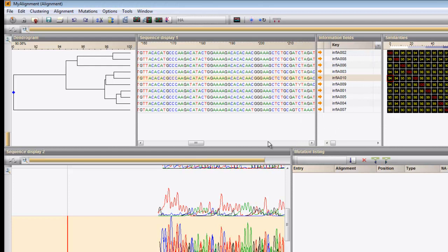A consensus sequence can be used to obtain a multiple alignment of all sequences against one single sequence. Depending on the type of analysis, the user may wish to assign a single sequence as consensus, or may want to calculate a consensus based on several sequences. Select the entries that you want to base the consensus on and press Create consensus from selected entries.